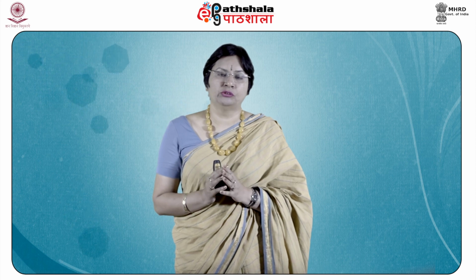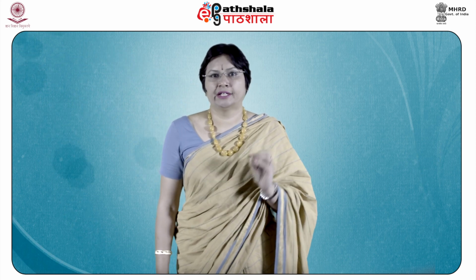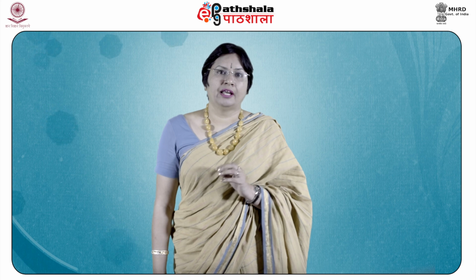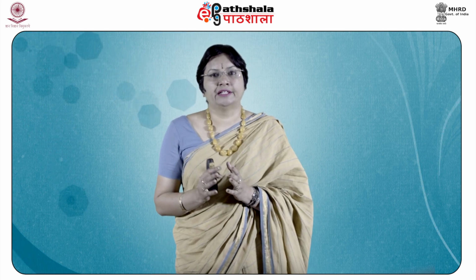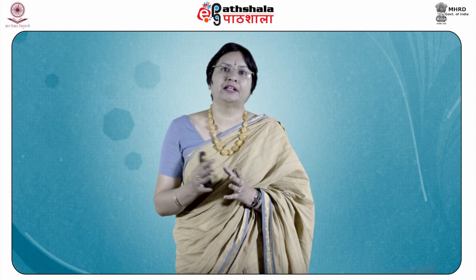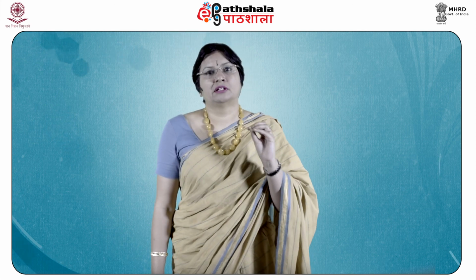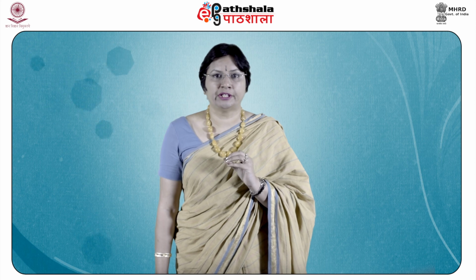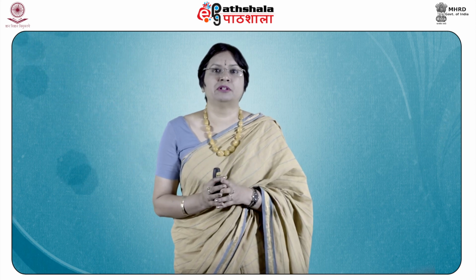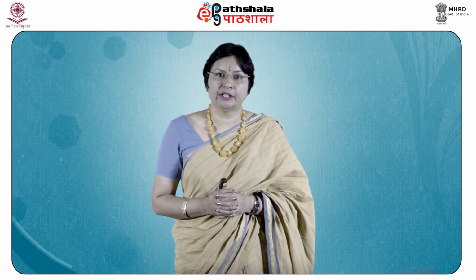So, after knowing all these tests, I am sure you will be able to analyze the post blast residue and find out what cations and anions are present, and correlate them with the cations and anions present in that type of explosive material. It will give a clue as to what type of bomb or explosive material was responsible for creating that explosion at the scene of crime.